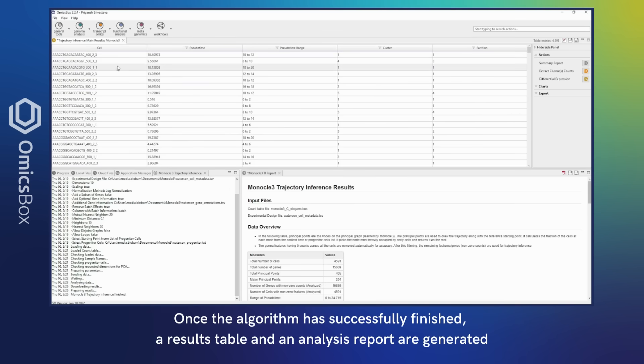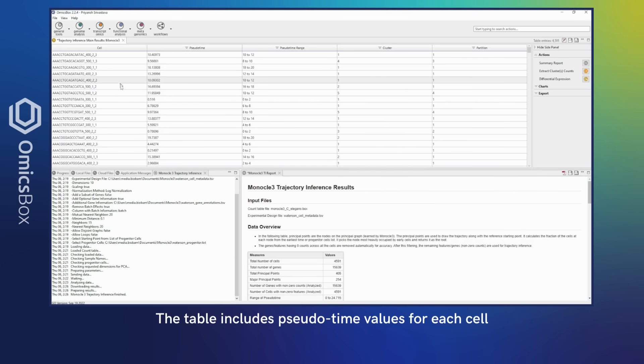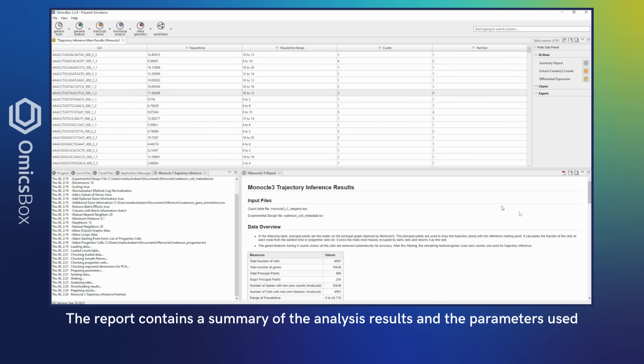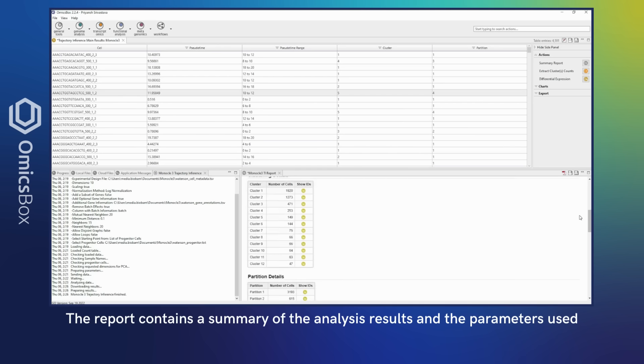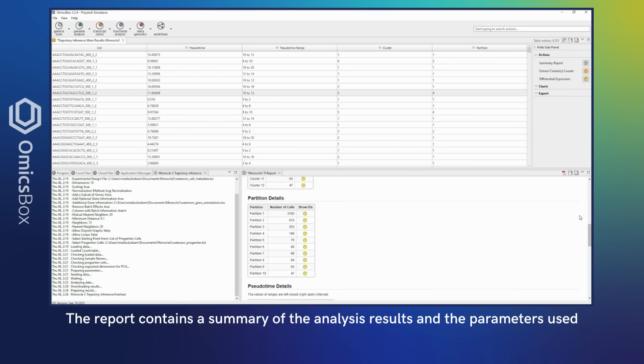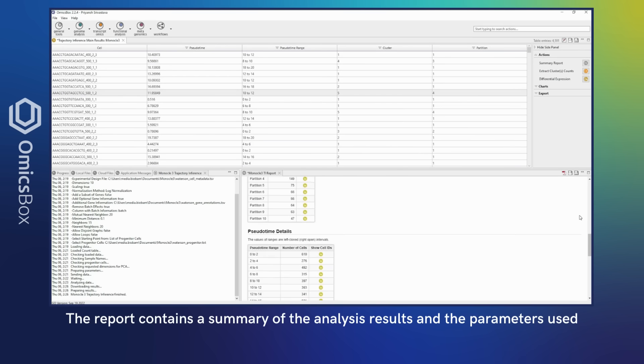Once the algorithm has successfully finished, a results table and an analysis report are generated. The table includes pseudotime values for each cell. The report contains a summary of the analysis results and the parameters used.